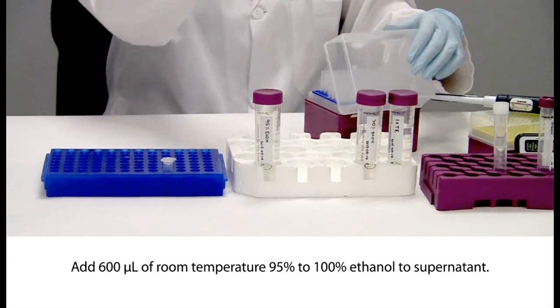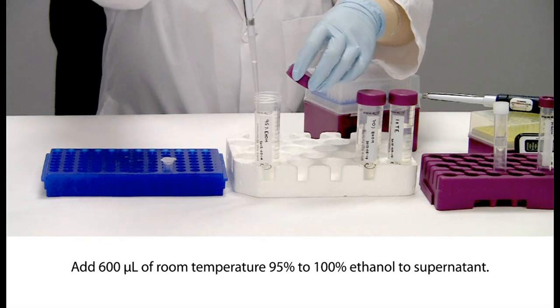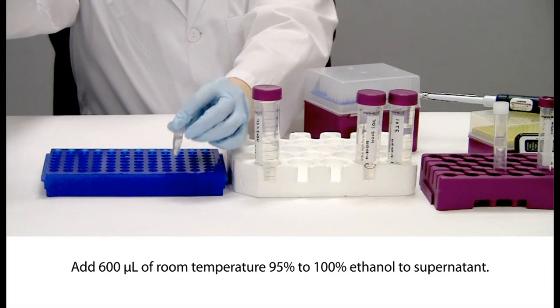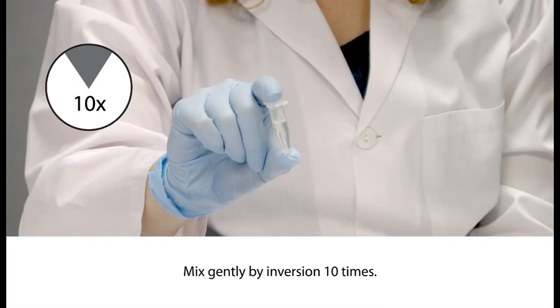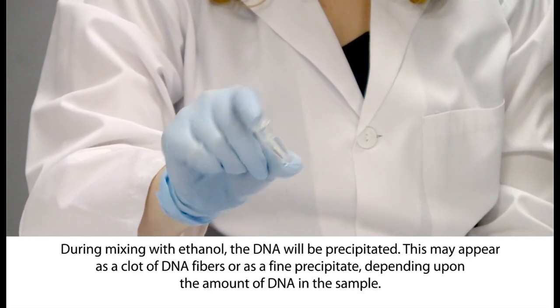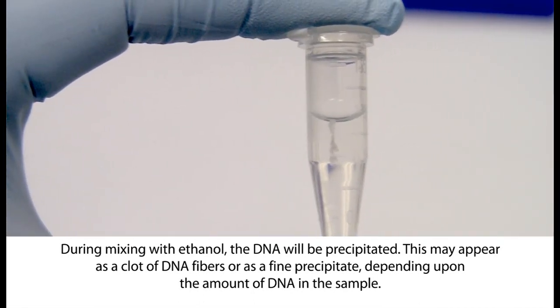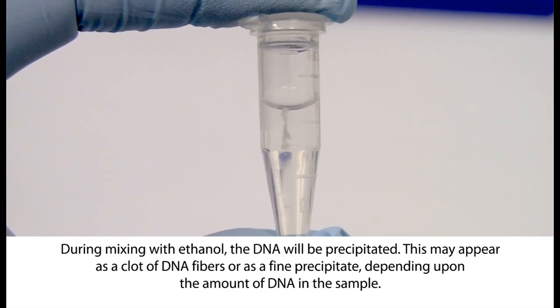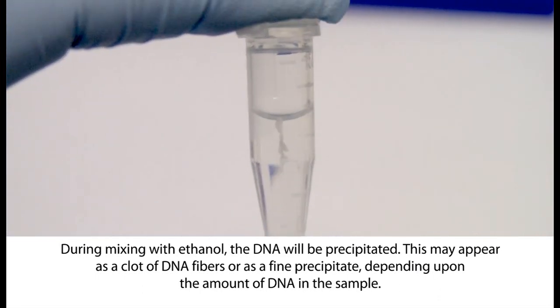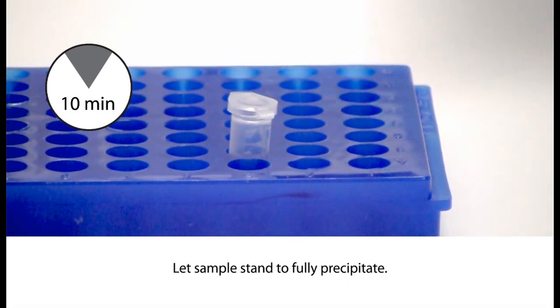Add 600 µL of room temperature 95% to 100% ethanol to the clear supernatant. Mix gently by inversion 10 times. During mixing with ethanol, the DNA will be precipitated. This may appear as a clot of DNA fibers or as a fine precipitate depending upon the amount of DNA in the sample. Even if no clot is seen, DNA will be recovered by carefully following the next steps. Let the sample stand at room temperature for 10 minutes to allow the DNA to fully precipitate.